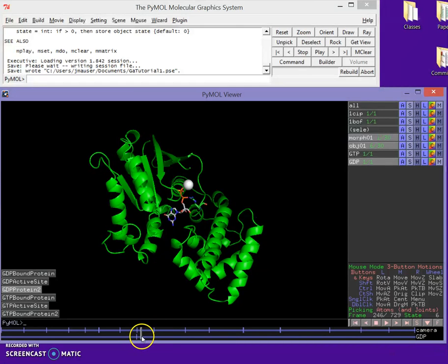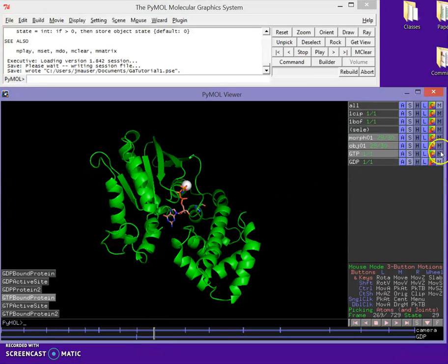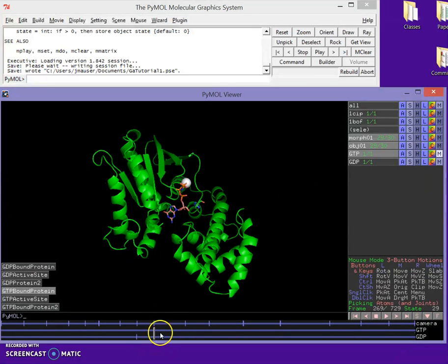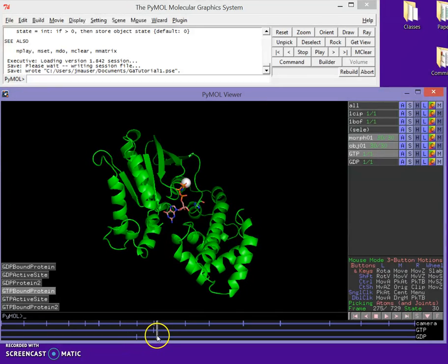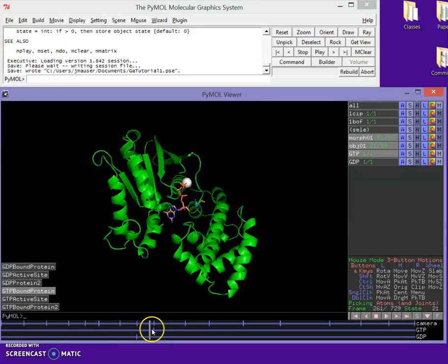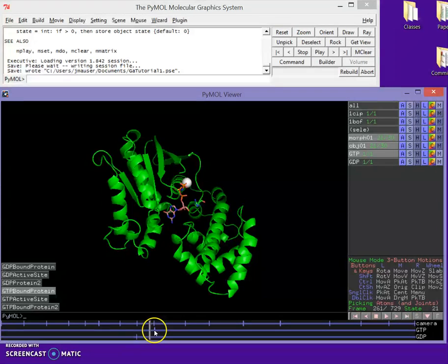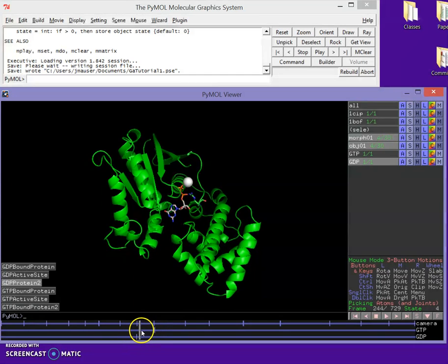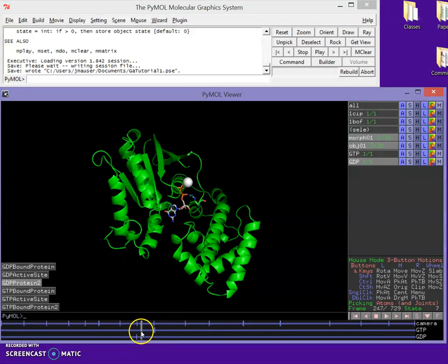I'm going to do the same thing at the other end where GTP is, but I'm going to store GTP at that state. And so those are now stored at the two different positions. GTP is here. And I might want to move that a little, right-click and drag it so it's perfect. Let's see, that's about right. Sure. That's good to me. So they're stored in those two positions.